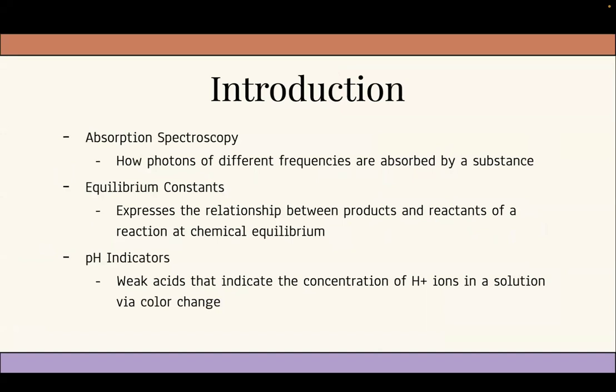Absorption spectroscopy, a fundamental technique in analytical chemistry, investigates how substances interact with light of varying frequencies. When photons of different frequencies pass through a substance, they are either absorbed or transmitted, providing valuable information about the substance's composition and concentration. In our experiment, absorption spectroscopy serves as a vital tool for quantifying the absorbance of an indicator at specific wavelengths, enabling us to determine its concentration in solution.